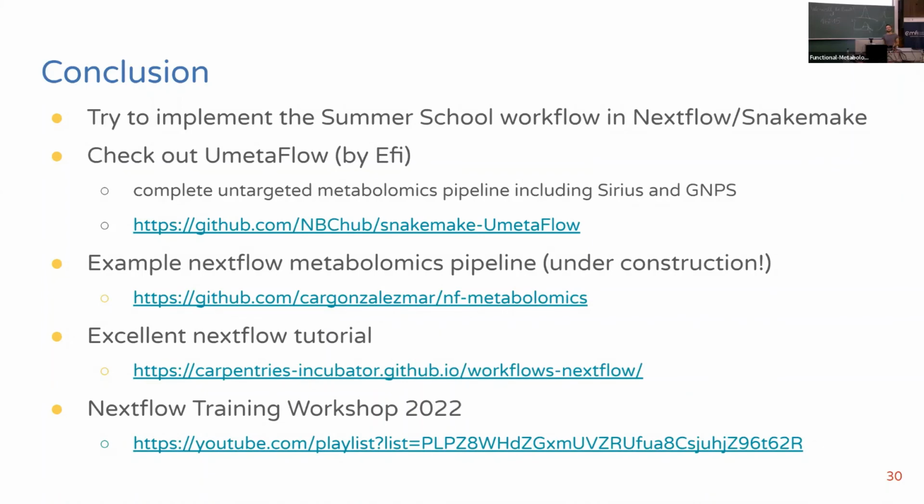And that's the cool thing. You could make it for your machine and then automatically run a pipeline that analyzes it on the fly once the data is generated.